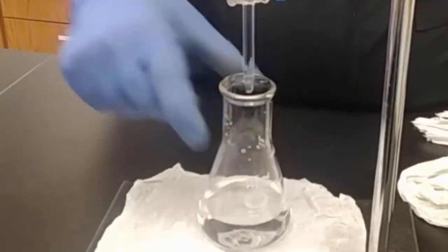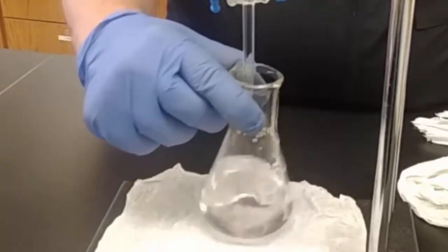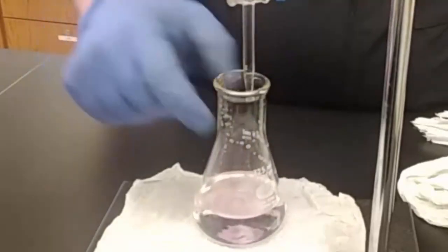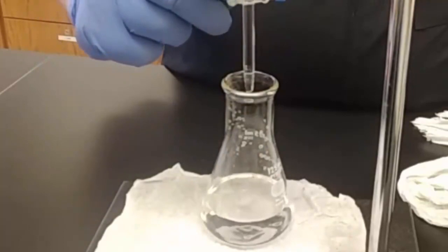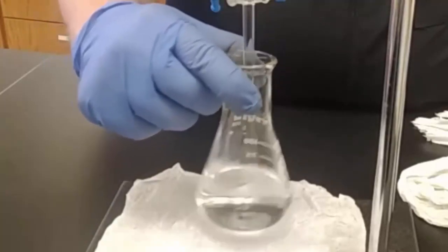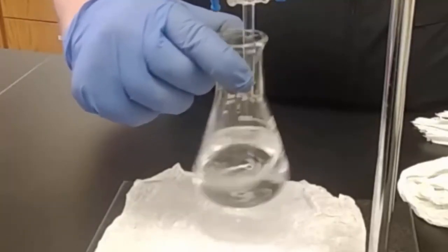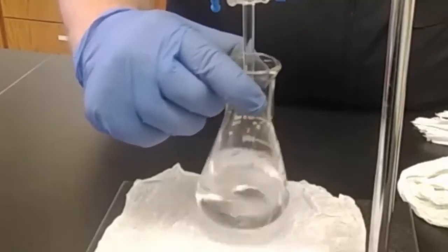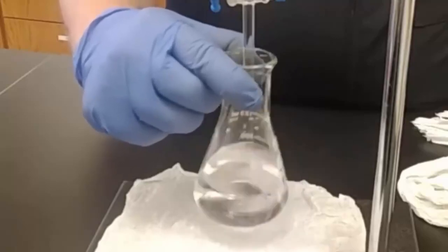Maybe it's gonna stay? Nope. Use a flask also instead of a beaker so that it doesn't splash and escape. I'll give you an extra close-up on the next one. Just want you to see all the action on this first one. Stay in pink a little longer, at least locally where the drop is hitting, but it's not staying permanently.